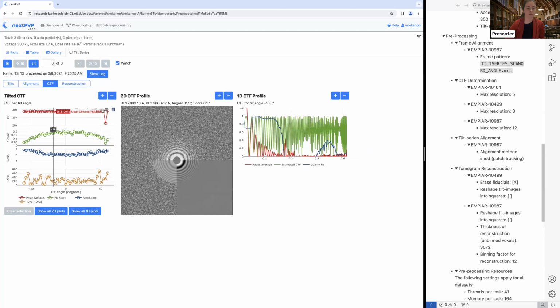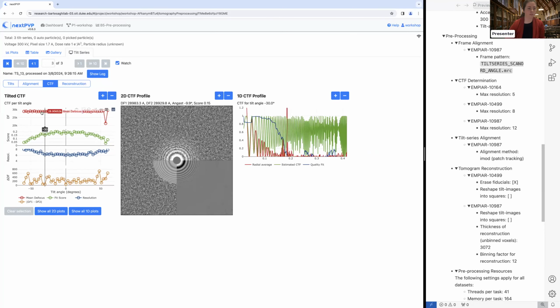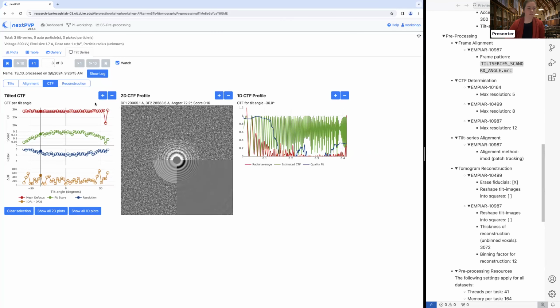And now we can see CTF stuff for this. And then we mentioned that you can export SVG plots for these. We use Plotly here, and you can do that here in this little camera snapshot thing. You can download your plot. And then there's a couple other tool features here that when you get more into the interface, you can play with as much as you'd like.